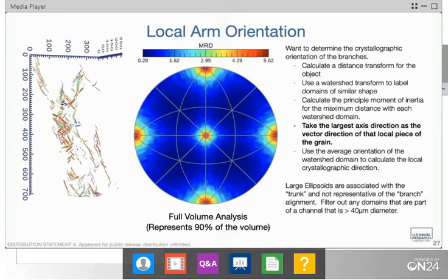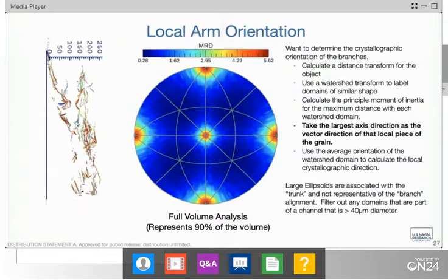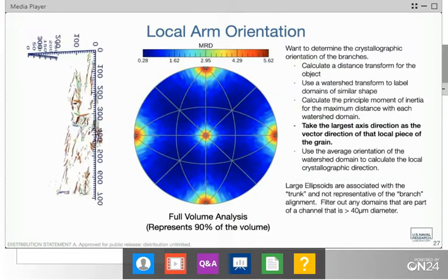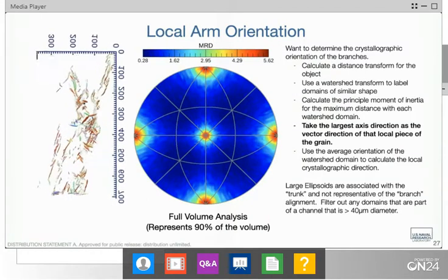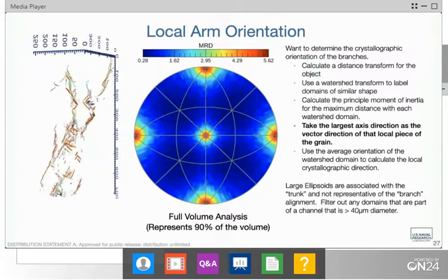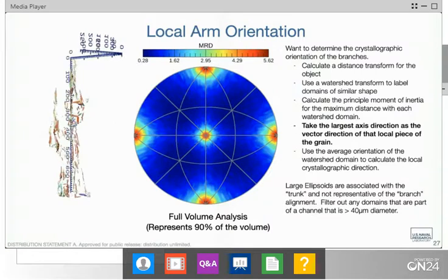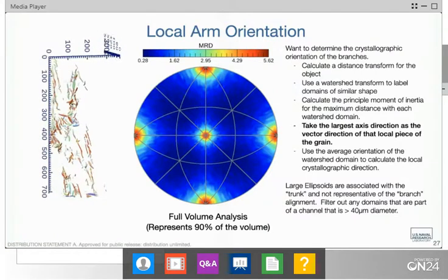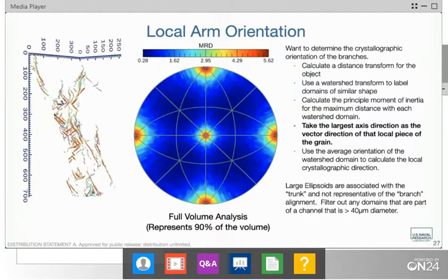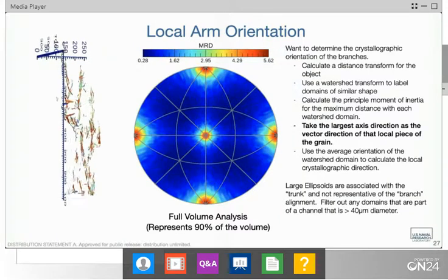But I will admit it's still a very heuristic decision, and it's not really quantitative. I think there are other techniques we need to look at. The world of bainites and martensites is extremely complicated, and it's one of the great challenges of how we as metallurgists clearly identify between those phases in terms of a definitive processing route in their formation.